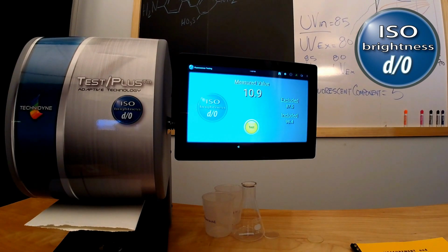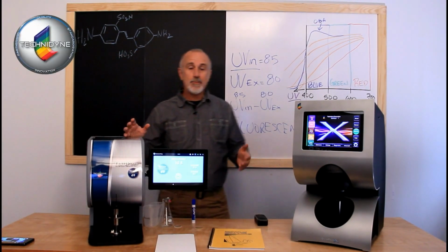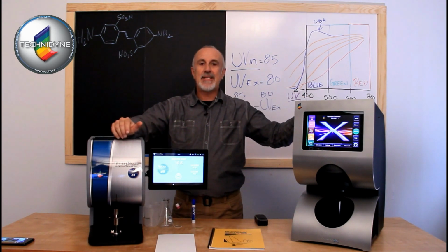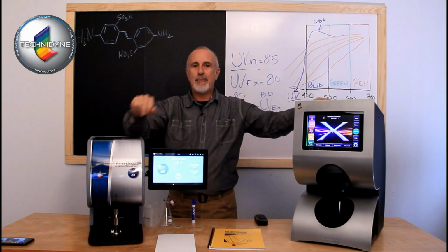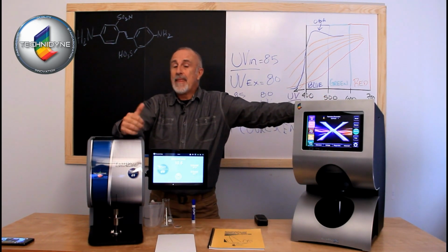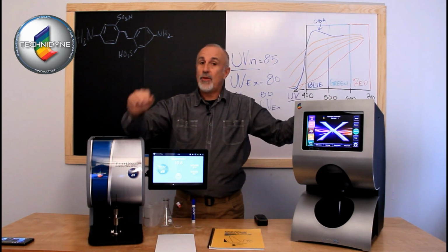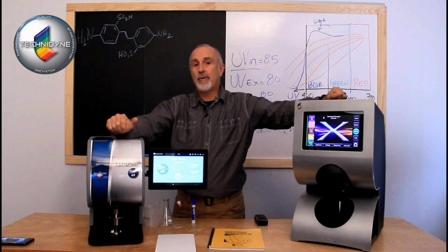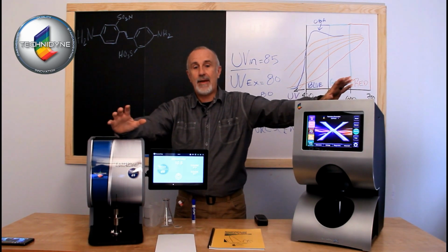Okay, so you can see even in this case, the effect of the optical brightener can be quite substantial in achieving the brightness levels that you need for your application. Again, if I had a sample on there that contained no optical brighteners, my reading would basically be 0. Sometimes you might see 0.1 or negative 0.1 just because the instrument has to reconfigure itself and may not come in perfect every time, but that's certainly acceptable. And even in some pulps, there are naturally occurring fluorophores that will be there. And even though you may not have added an optical brightener, you might see a number of 0.3, 0.4, and it's probably due to some natural fluorescing going on with that, even though you haven't added it to it.